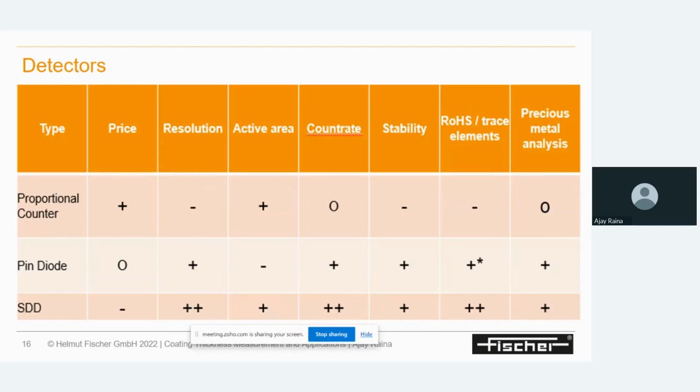So you need a very sensitive instrument and a very good count rate. For this type of application, I will recommend an SDD type of instrument.